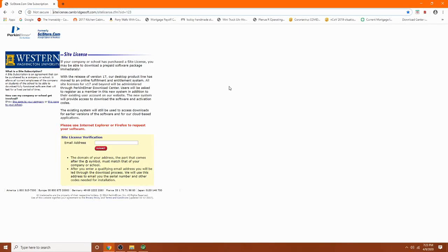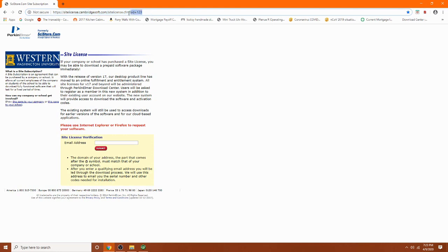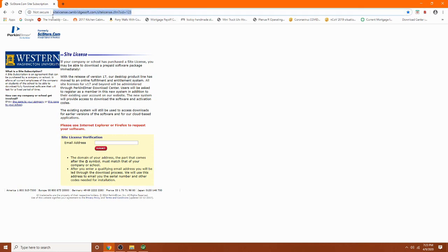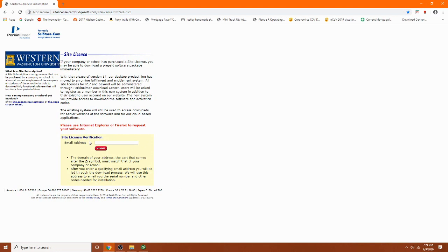So I wanted to show you how to draw TLC plate using ChemDraw software. In order to do that, you need to first install the professional ChemDraw from this link. If you go to this link and register using your Western email address, they will send you a ChemDraw verification code and registration number and installation guidelines. So check your email and follow the guidelines and you should be able to install the ChemDraw software on your computer.